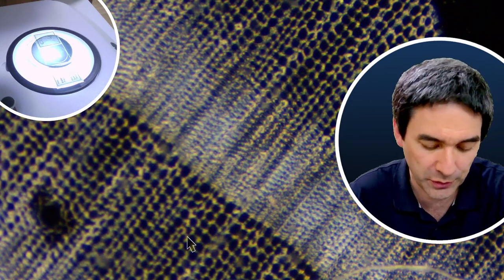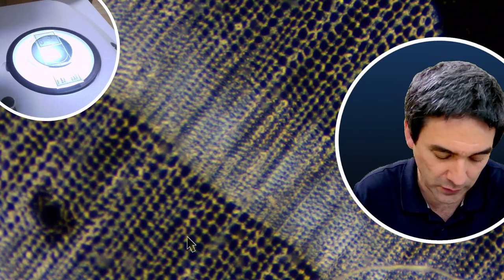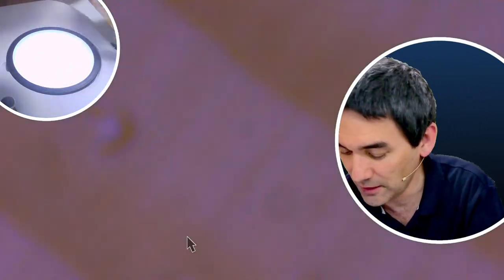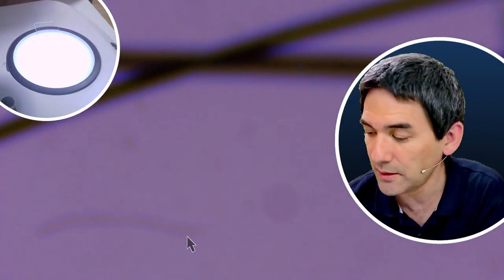I won't even bother to put water on here. But let's have a look. I don't know if I've got mostly black here. I see mostly black because some of my hair now starts to turn white as well. I'm not the youngest anymore. And let's put a little bit of hair under the microscope. Here we go. And let's see what happens.